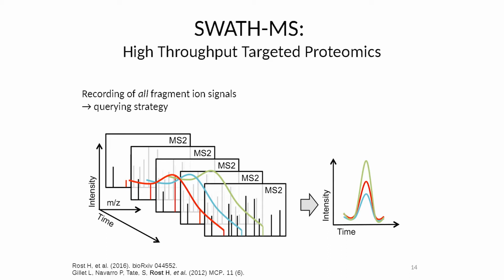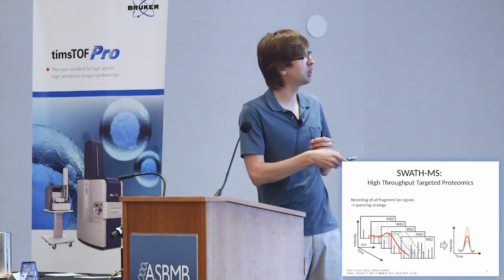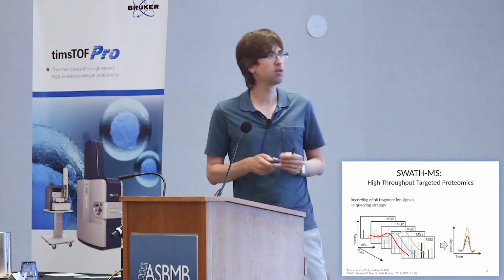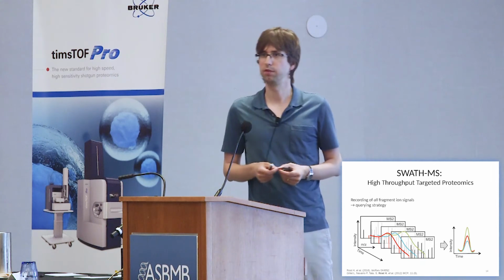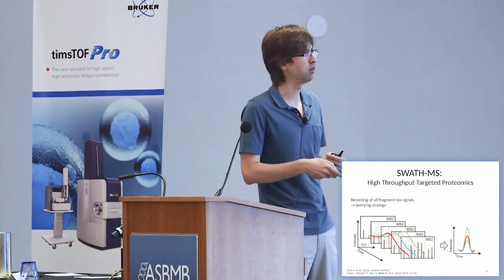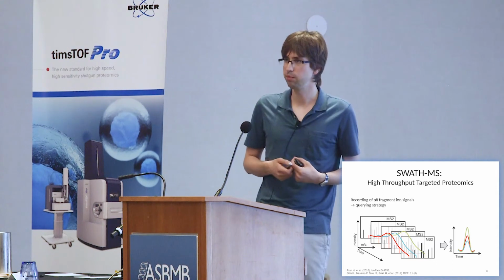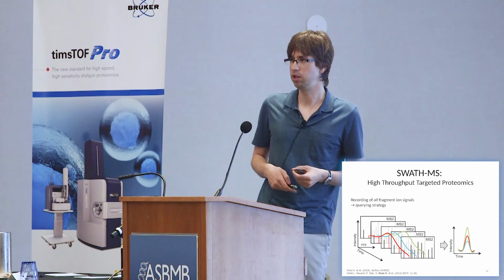And we would then go into this complex multiplexed MS-MS spectra, and we would specifically extract the fragment ion traces for these 3 fragment ions and then plot this as a chromatographic trace and interpret the data using a targeted proteomics paradigm. So we would then look for coelution of 6 or more fragment ions and would use this to identify and quantify the peak here.